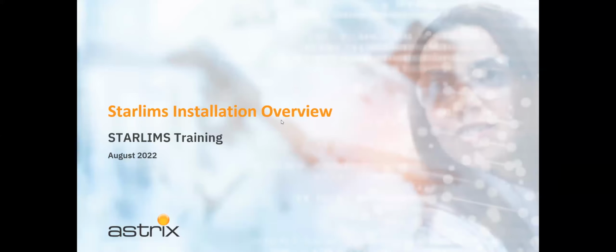All right, so this has to do with the installation of the STARLIMS system. And, to be fair, I can't imagine being on your end looking at a STARLIMS system for the first time, for example, and absorbing, hey, you know what, we're going to be working in a LIMS system that's pretty complicated, and we're learning about sample workflows and laboratory processes and the business end of what it is that a LIMS system actually does, which is complicated enough.